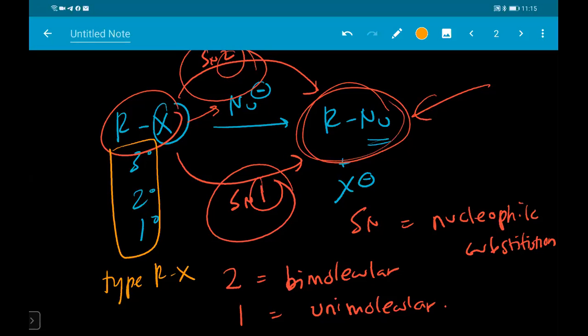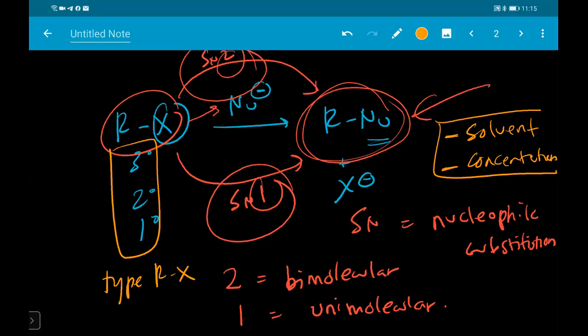Okay? And another case tadi untuk SN1, SN2 tu kan. So we're going to study the solvent and also the concentration of nucleophile. Okay, ni faktor-faktor yang tanah runtuh, roadblock police semua ni tadi. Itu yang kita akan study. So it's going to affect our option kita nak pilih. Either we're going to go to the highway ataupun kita akan pakai jalan dalam. So that is the idea of the third experiment ni.